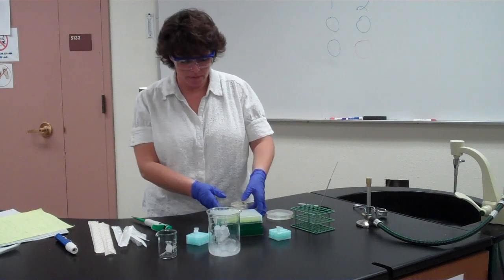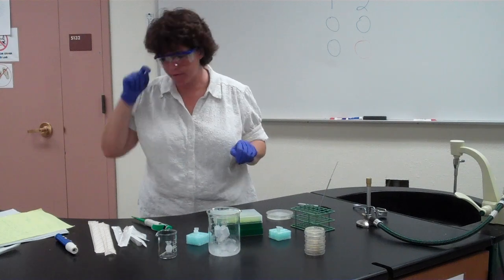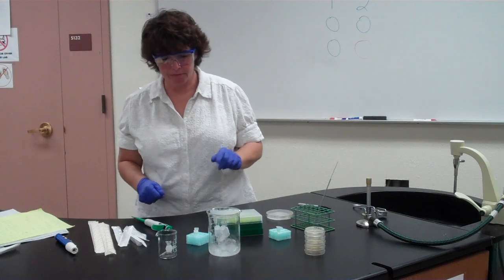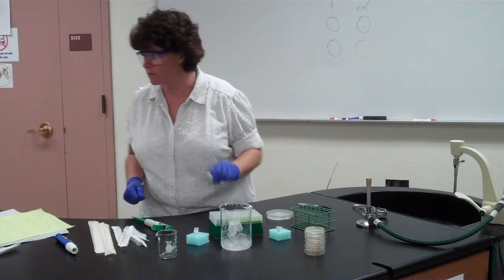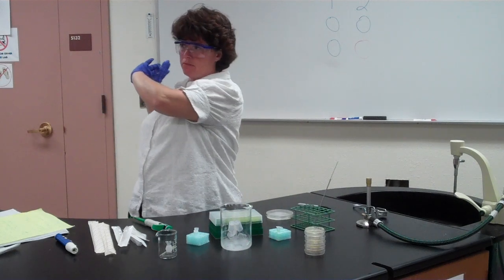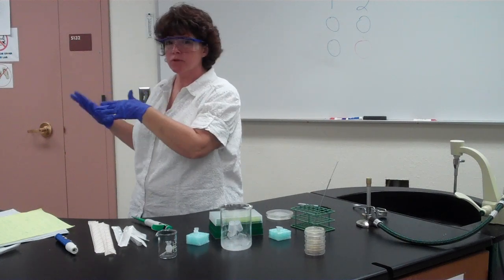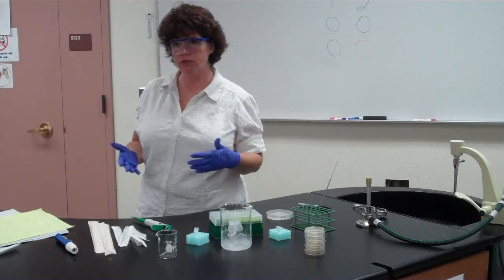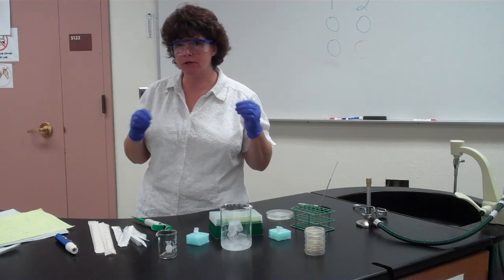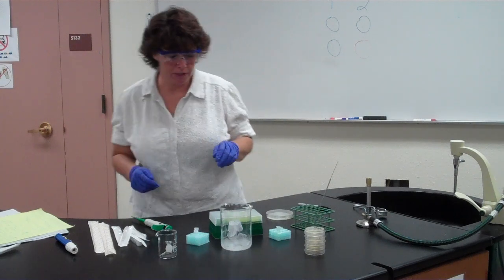While those are sitting for 15 minutes, get your plates labeled and organized so you know what to do with them later. After 15 minutes, take your tubes to the water bath on the far side of the room by the incubators. It's set at 42 degrees Celsius — just warm enough to shock the bacteria and make their membrane slightly porous without killing them.